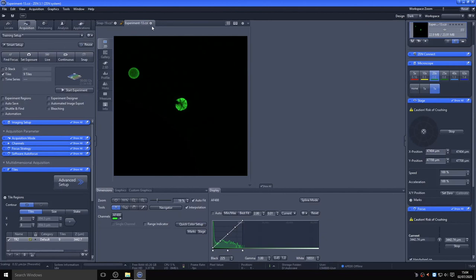This will not only save the image but also leave the imaging conditions for laser power, gain, lens, scaling, etc., within the metadata of the file so that you can refer to it at a later date. If you try to close an image which has not been saved, it will prompt you to save or discard.